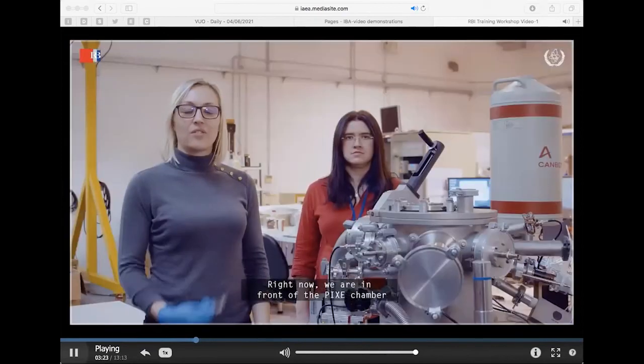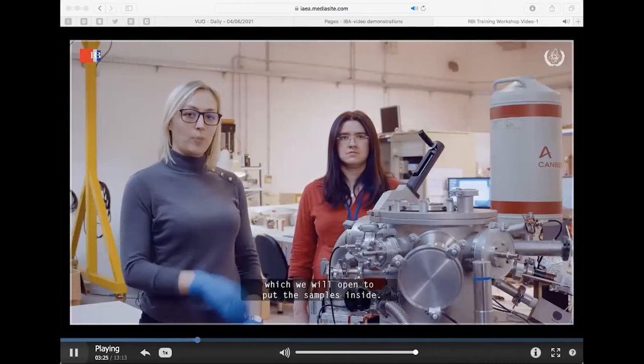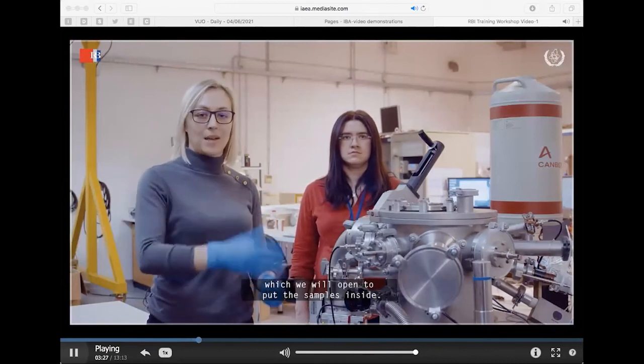So right now we're in front of the PIXE chamber, which we will open to put the samples inside.